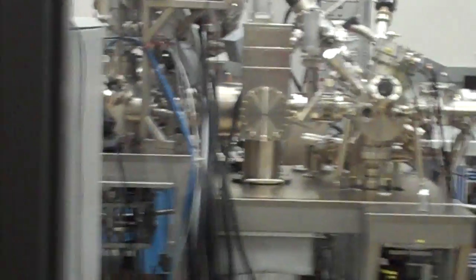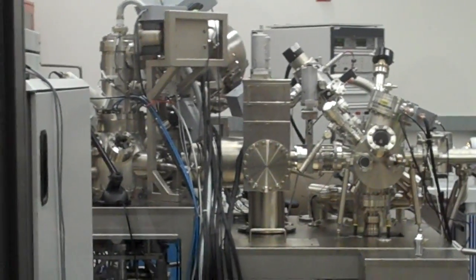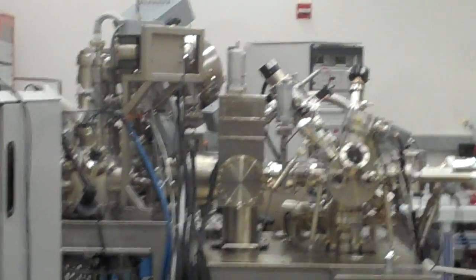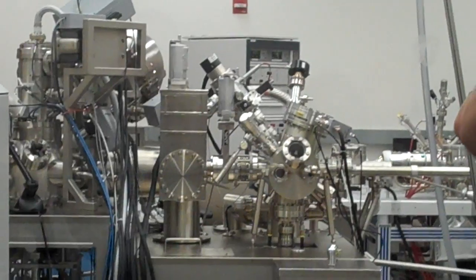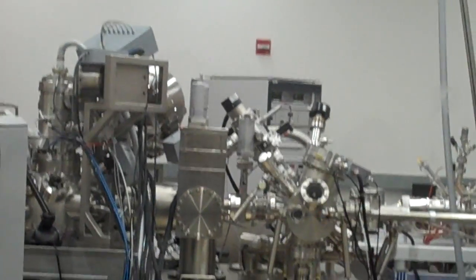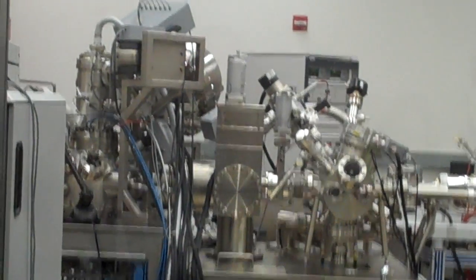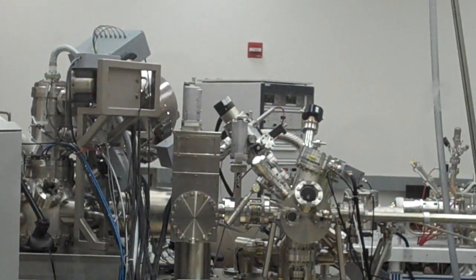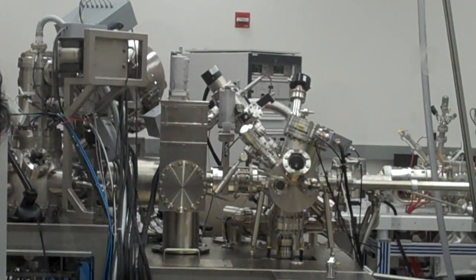What's the name of machine that you're using here? This is actually a nanoprobe. So if you have a wire and you want to measure the conductivity of it, if it's a nanometer-wide wire, it's very difficult. You can't just put alligator clips on it. So there's a whole machine designed to have several little probes that you can touch to your nanoscale wire and then measure the current, the conductivity of just that wire. It's a simple process, but it's very difficult when the wire is too small to see.